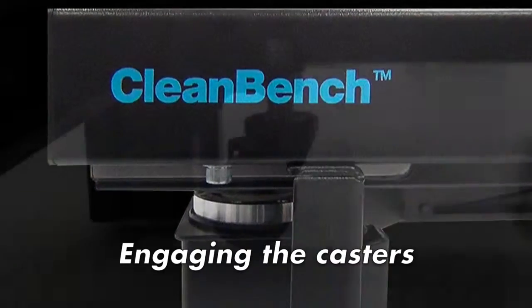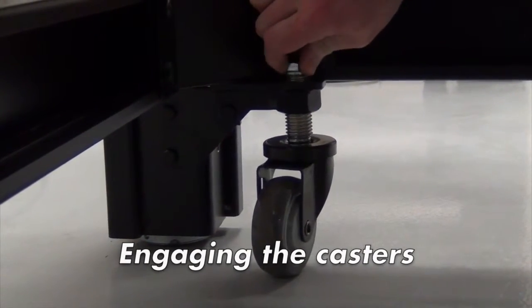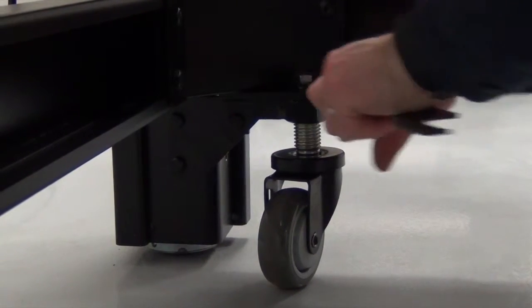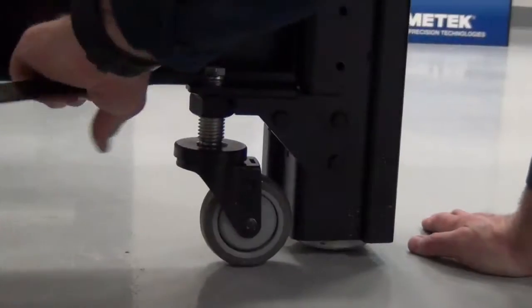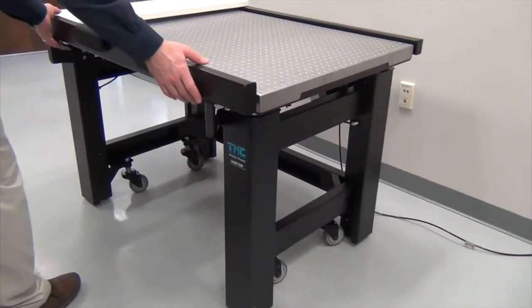Casters can be engaged using the wrench provided in the hardware bag. This is the same wrench used to adjust the leveling foot, just the opposite end. When engaging the casters, a fair amount of force is required to lift the table. Engage all four casters and the table is ready to move.